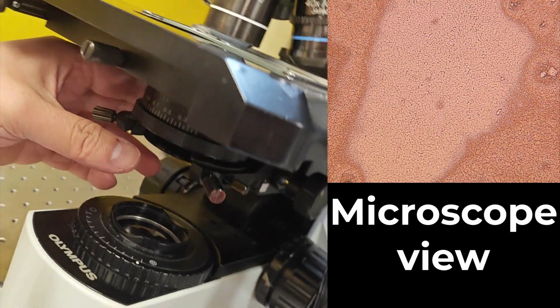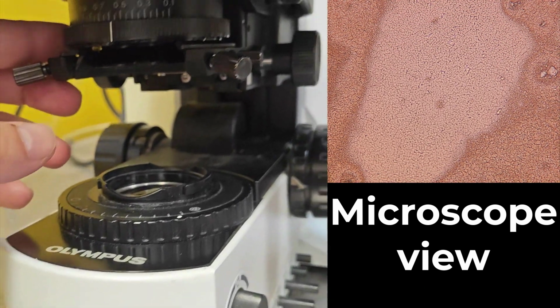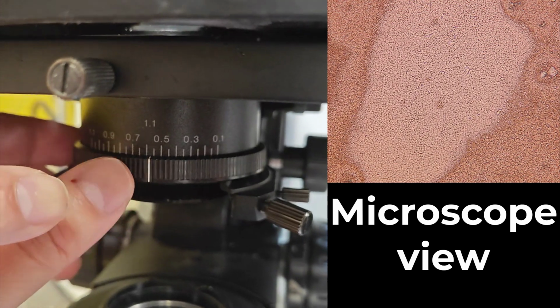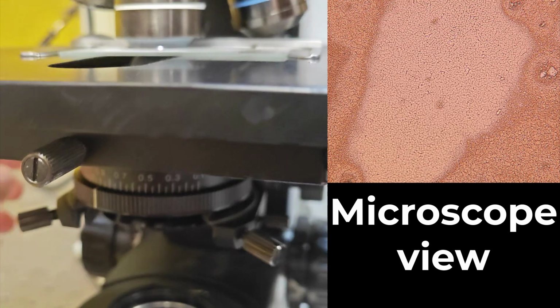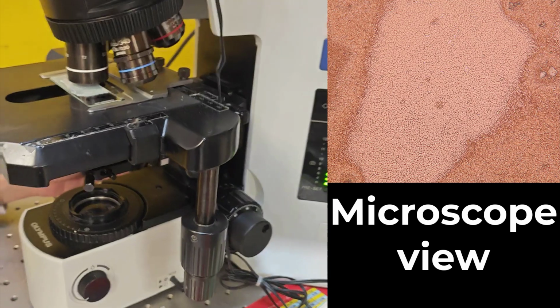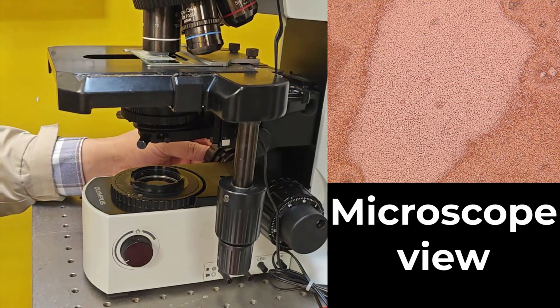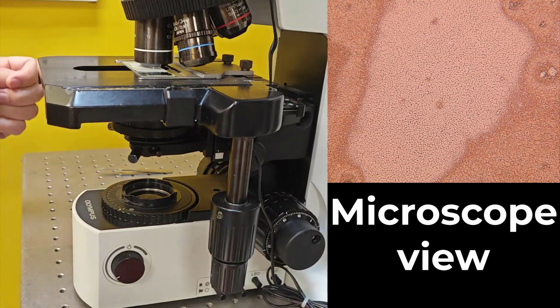On the condenser, there is an aperture ring with numbers on it. This is an NA number, which needs to be matched with the numerical aperture of your objective. In this case, our objective is a 0.9 NA objective, so you want to adjust the condenser aperture to match this number. Lowering the condenser NA will offer better contrast while compromising the resolution, so you can choose properly according to your preference. But NA greater than the objective NA cannot offer any advantages. This is how we adjust the transmission illumination path.